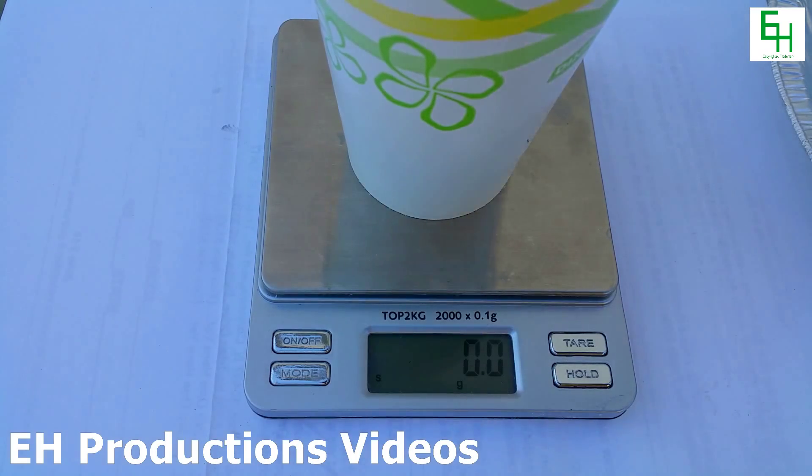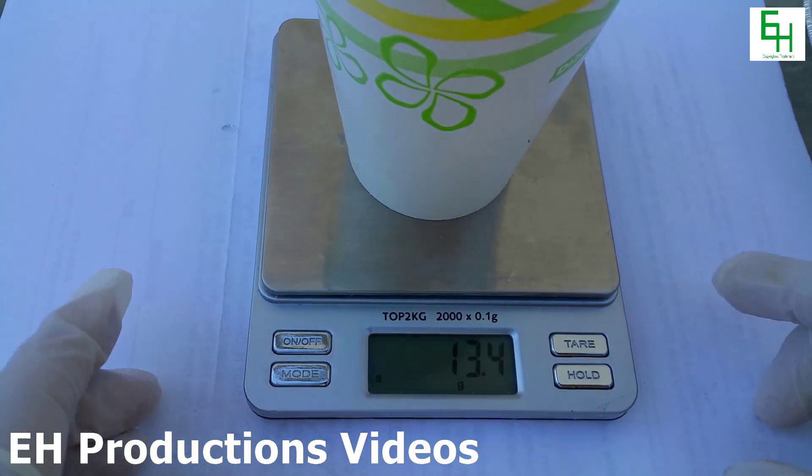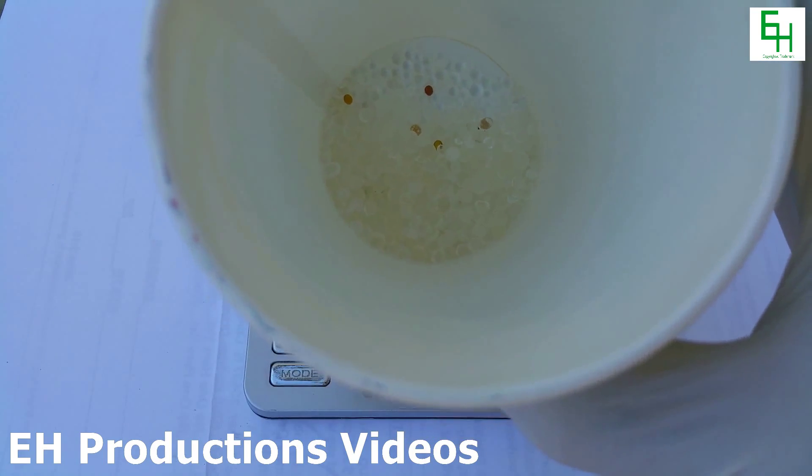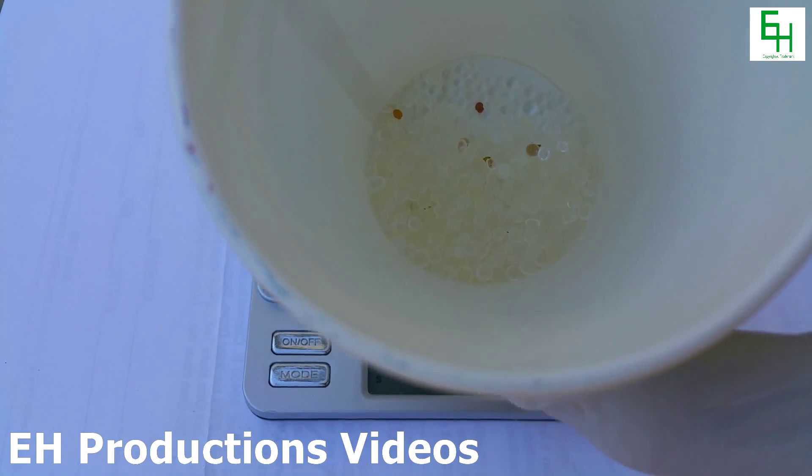As you can see it is zeroed out over there. Okay so I'm going to now cut these packets open. Here I have approximately 13 grams of this but that's okay because later when we crush it up we'll weigh it out again.